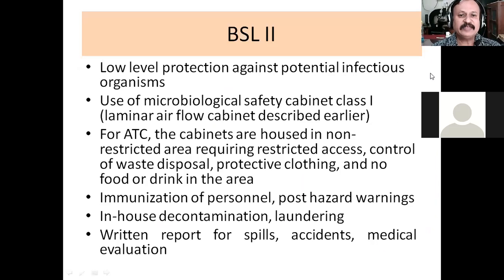Then we go to the next level, which is called biosafety level 2. This particular facility is there to offer a low level of protection against potentially infectious organisms.